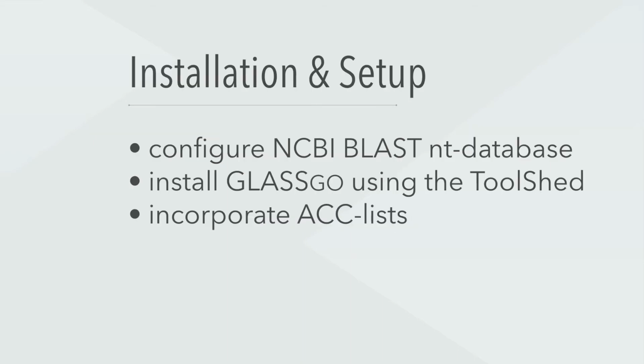We start with configuring the BLAST database. In other words, Galaxy has to be made aware of it. And this is a general approach that holds true for all tools in Galaxy that utilize this database. In the next step, we will want to install the GLASSgo Galaxy wrapper using the Toolshed, and finally we want to incorporate the accession lists using a custom script.